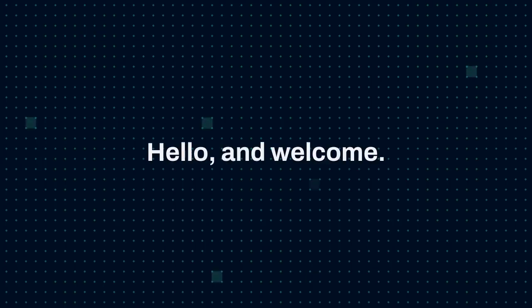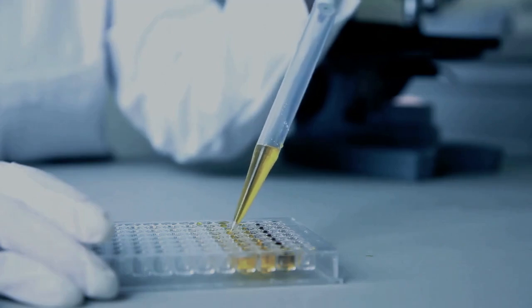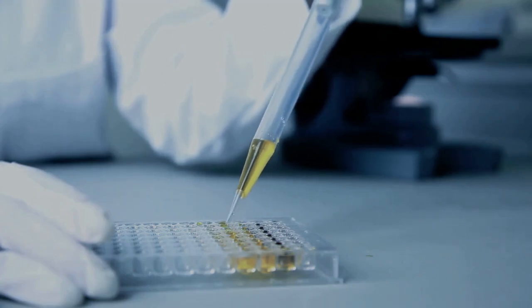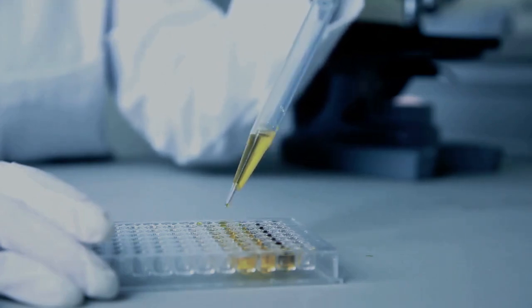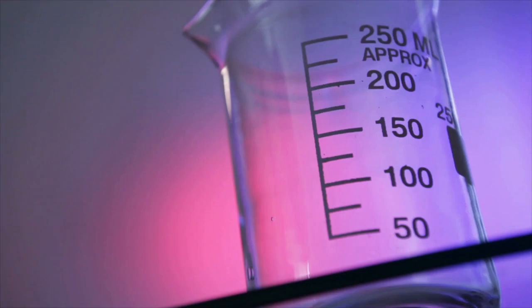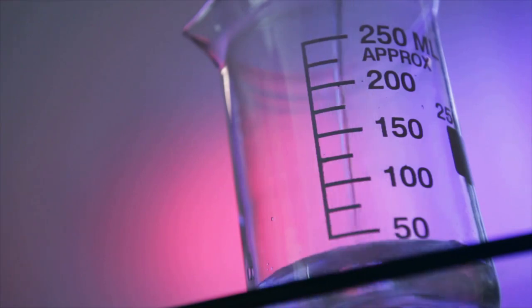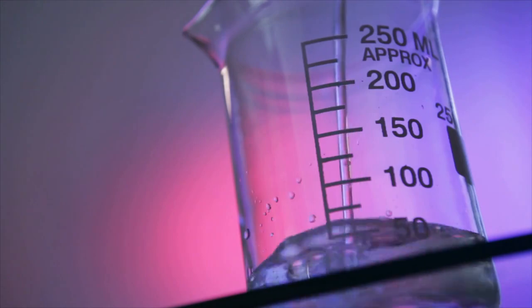Hello and welcome. Have you ever wondered how scientists measure the amount of a substance in a liquid, even when it's completely invisible? Today, we're going to explore a foundational technique in biochemistry that does exactly that: photometry. In the simplest terms, photometry is all about measuring light. Specifically, it's a technique used to determine the concentration of a substance by measuring how much light it absorbs.